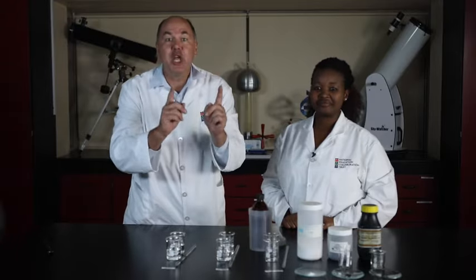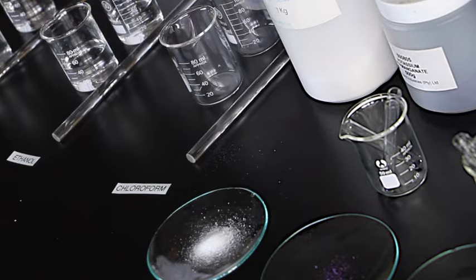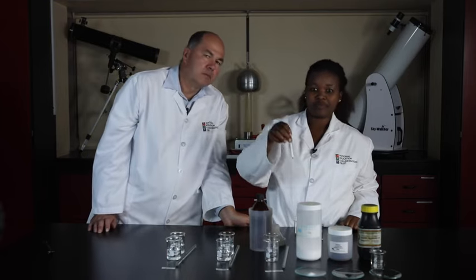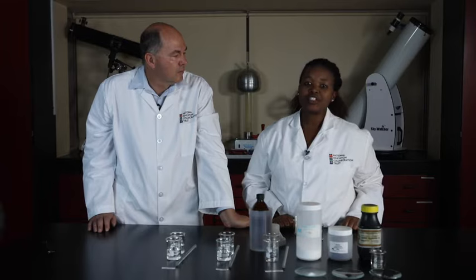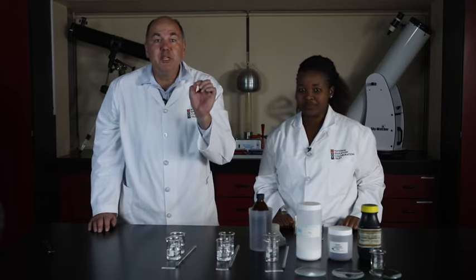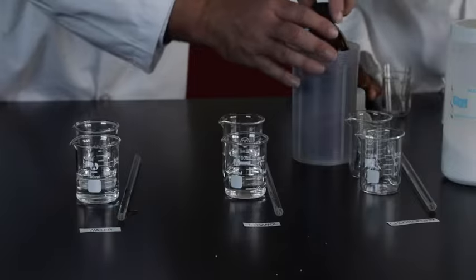Right, now we change the solute, and this time we'll use potassium permanganate crystals. We will use only a few crystals of potassium permanganate in each beaker. If we use too much, it may form a solution which is so dark in color that we won't see whether there are any crystals left over.